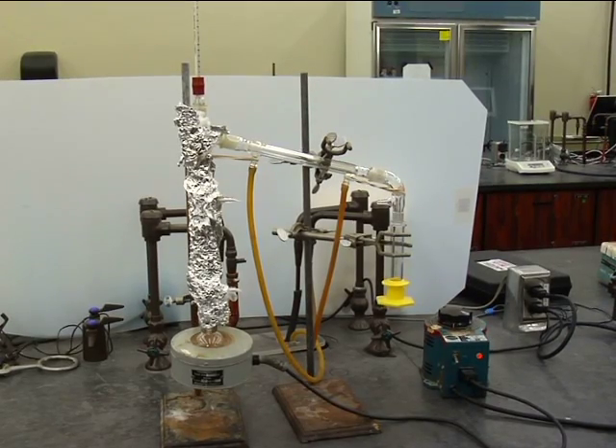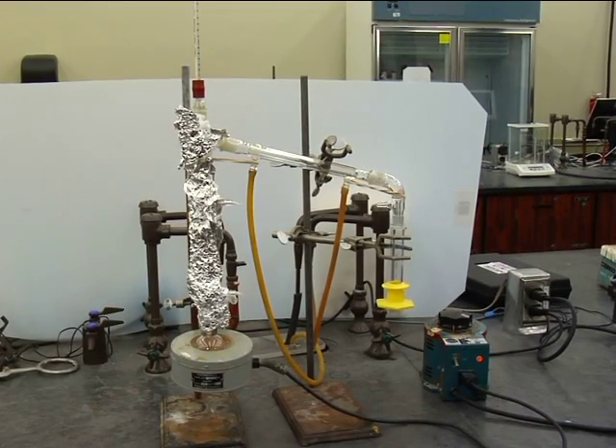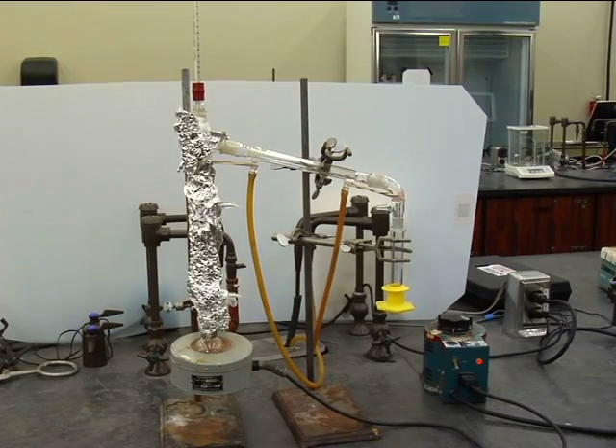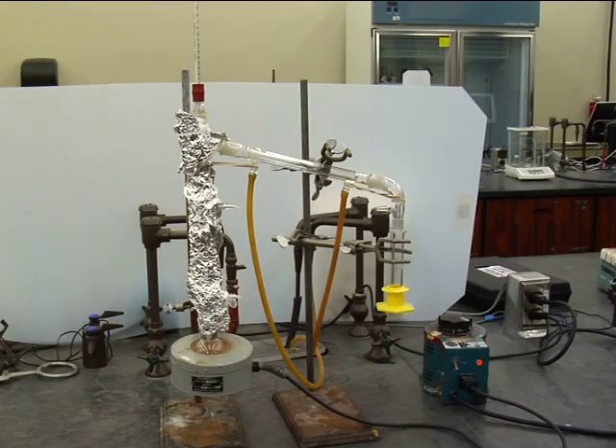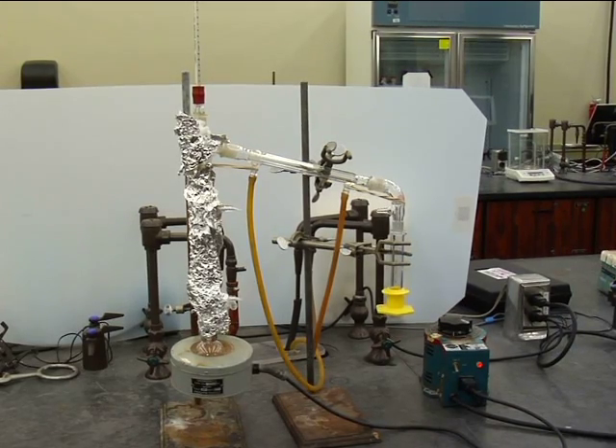Have your apparatus checked by the instructor. See your lab manual for instructions and proper settings used in carrying out the distillation, for the proper recording and analyzing of data and samples, and for instructions on disassembling the still and waste management.